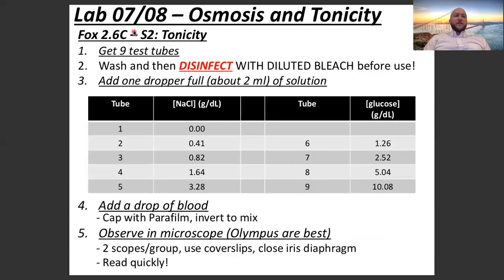All right, so this is going to be FOX 2.6C S2. We're going to get 9 test tubes. We're going to wash and disinfect them with bleach before we're using them. Make sure they're clean. One dropper full, about 2 milliliters of solution.